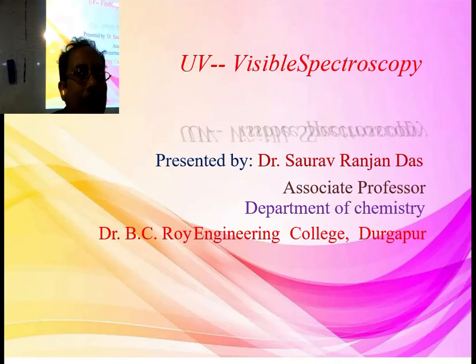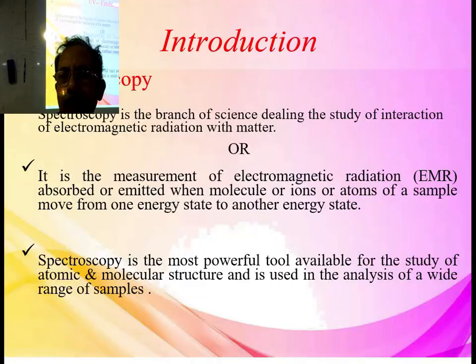UV visible spectroscopy, which we have already completed halfway. So today I will finish it, and IR spectroscopy also. Both are halfway done. Some IR spectroscopy and some UV spectroscopy is completed, but I am continuing with the rest.